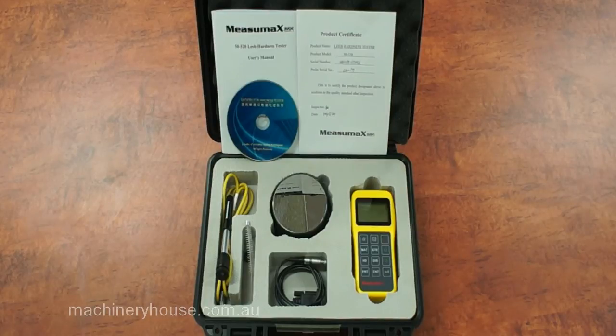The portable hardness tester is designed to test most metals, primarily steels, cast iron, aluminum alloys, and copper alloys.